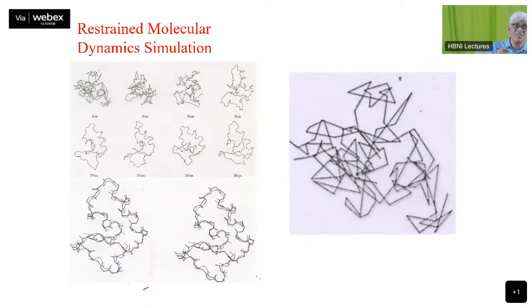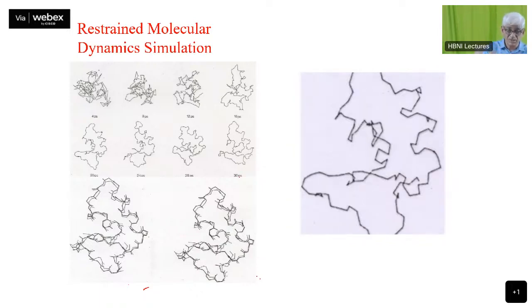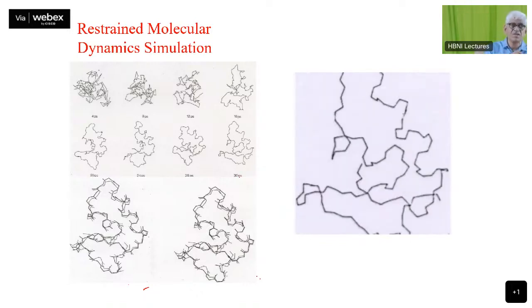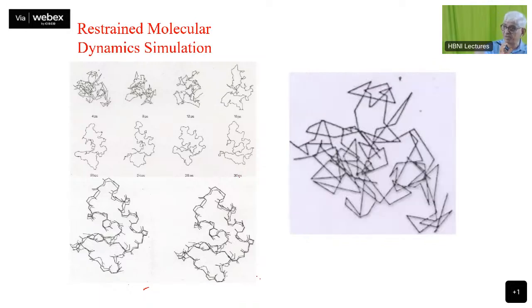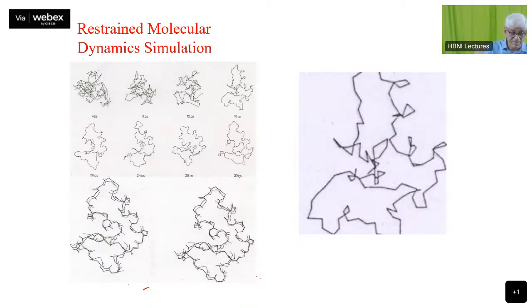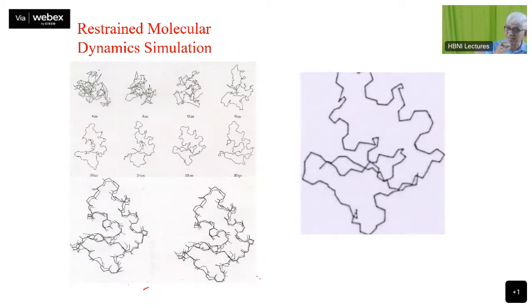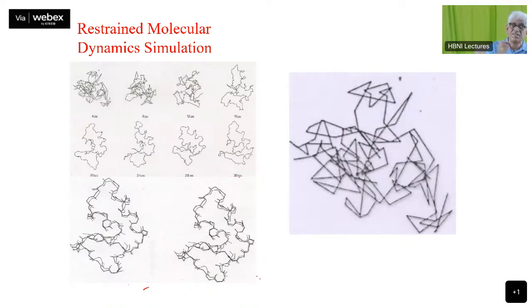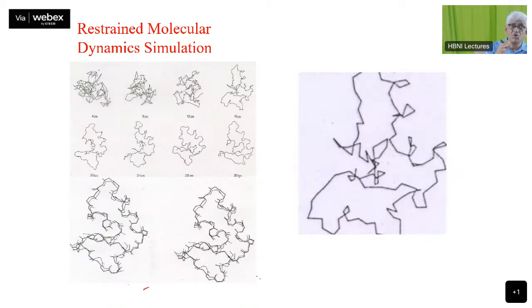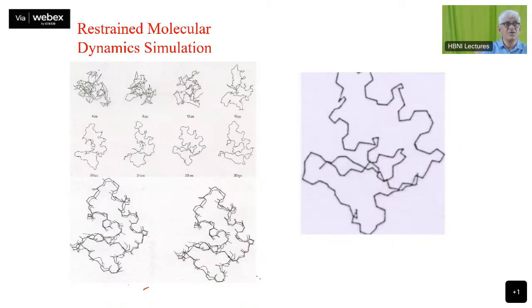This, as I said earlier, defines the accuracy of your distance constraints, how good your distance constraints are. If they are very good, then you will find all of them exactly on top of each other, but rarely will you find that. Some portions may be very good, some portions may be poorly defined, and that can happen. This typically happens in the loop areas. When there are loop areas, the structures are not so well defined because the NOEs are not so well defined. There is more dynamics intrinsically there. The NOEs do not represent the distances so quantitatively. So in that situation, either you will have a smaller number of NOEs or you will have imprecise distance estimations, so you will have fluctuations there.